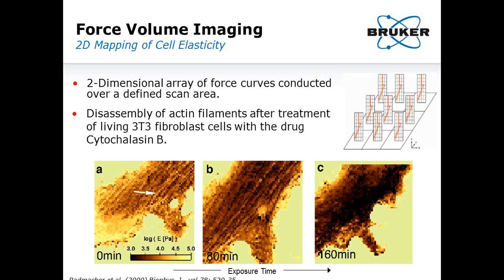To date, force curves and force volume are the most commonly used AFM modes for measuring and mapping nanometer scale mechanical forces. Unfortunately, though it does provide valuable and reliable quantitative measurements, force volume imaging suffers from slow acquisition speeds as well as low spatial resolution. As a result, this has hindered its widespread acceptance as a standard technique for studying the nanomechanical properties of living cells.